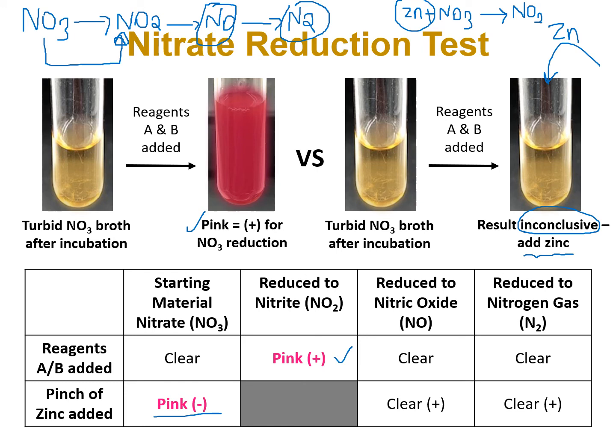And that's why I was saying pink means two different things depending on when you see the pink color. Now, if you see the pink color after adding zinc, that means that my bacteria cannot reduce nitrate. Let me explain why, because it's kind of confusing. Let me write it right here.